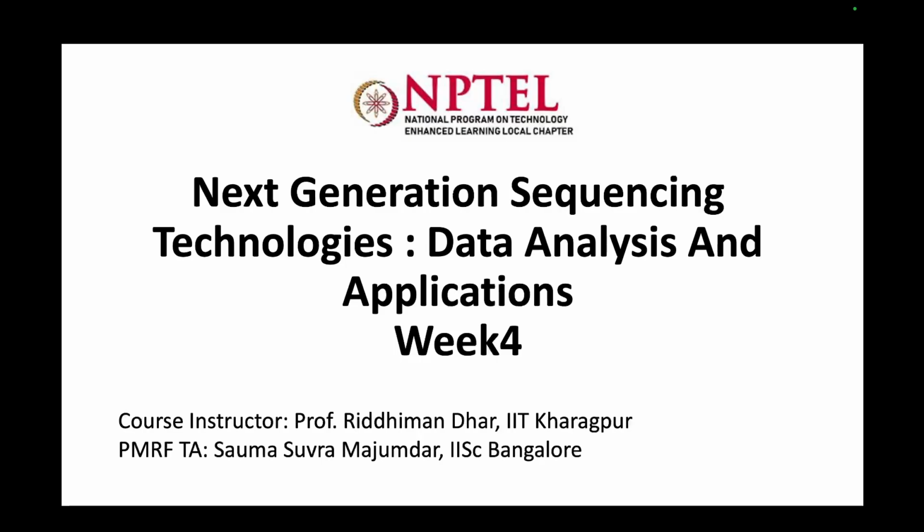For example, the human genome. It's a very big data set for one particular genome of a human cell. So how do we handle that? How do we use certain techniques to compress our data? Because without compressing, the file will be so large that it cannot be properly used to do anything with it.